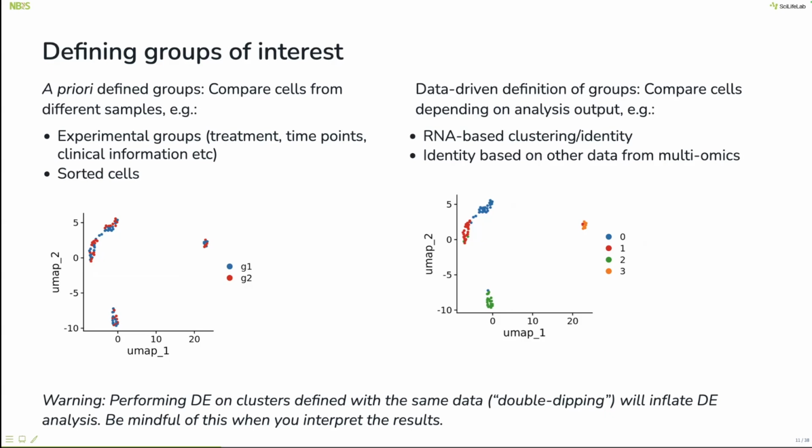Yes, question. Hello, Jennifer. I have a question regarding this UMAP on the right. There are some cells which fall in different cluster sets. So when you do differential gene expression analysis, do you remove these cells before you run the differential analysis?